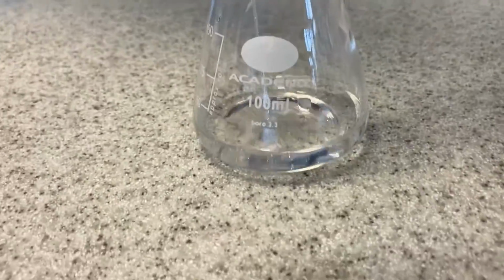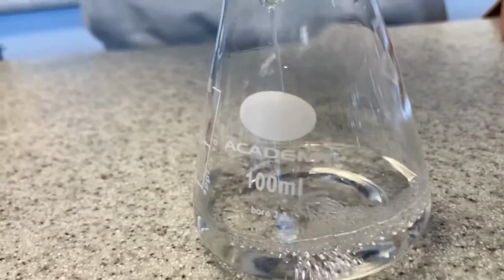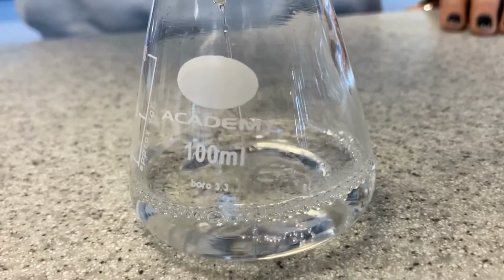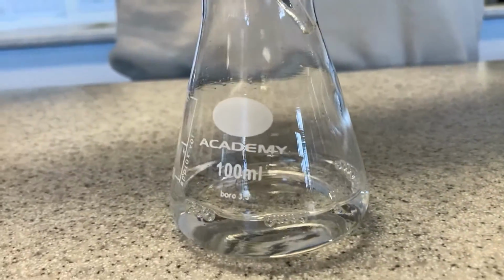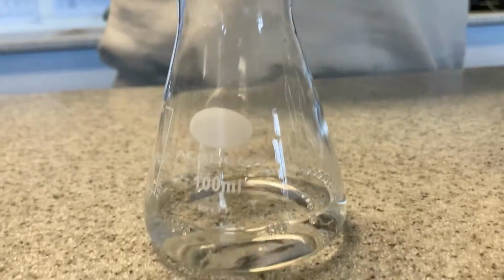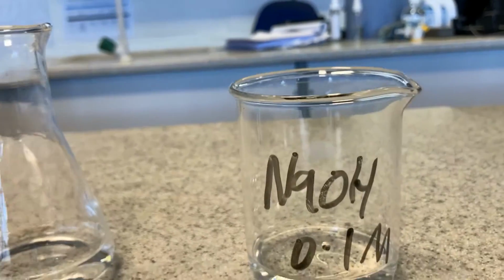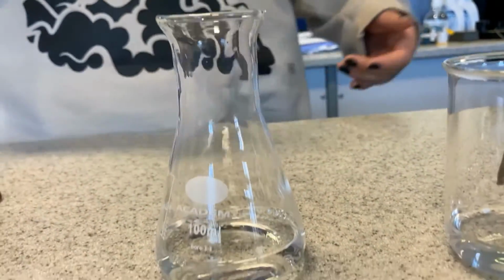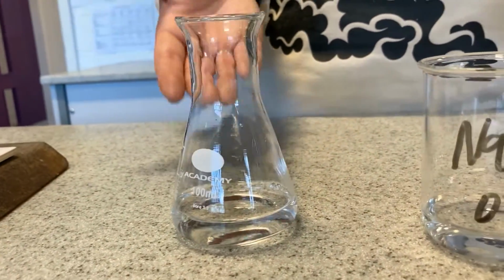So now we know in this conical flask is exactly 25 millilitres of sodium hydroxide. And we know because of what's written on the beaker that its concentration is 0.1 molar. So it's 0.1. Not that strong a concentration if you think about it. Okay. So now both of these liquids are clear, if you hadn't noticed. So how on earth are we going to know if this has reached a pH of 7?